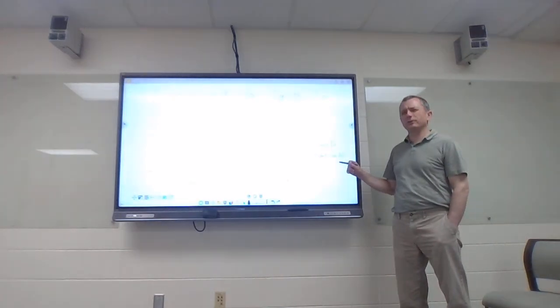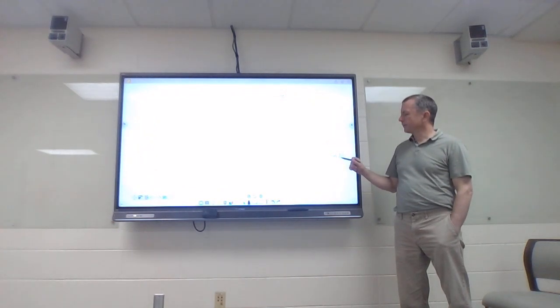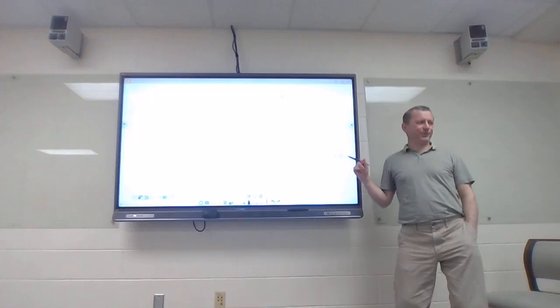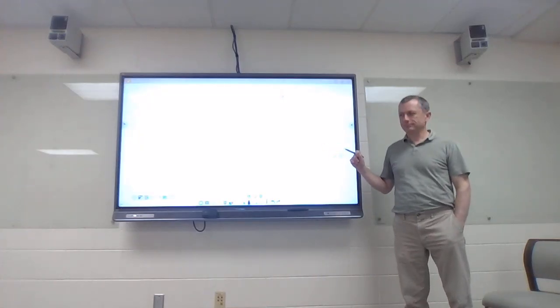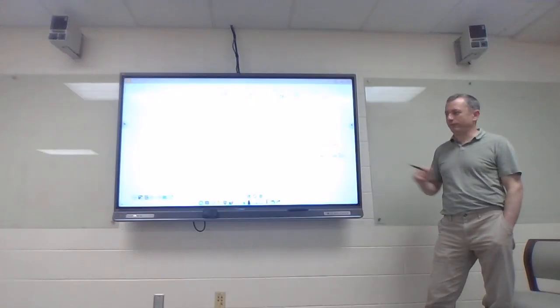Sorry, I got that backwards, don't I? Let's say it was 900 hertz. 900 hertz on a 90 megahertz machine. What do I end up with for ppm?